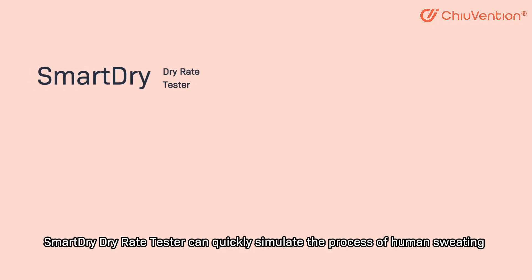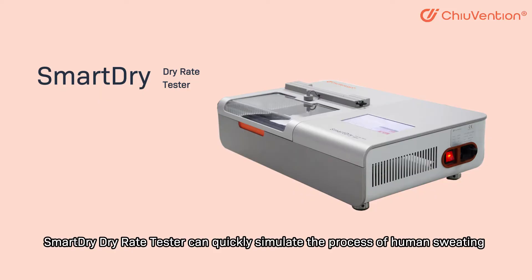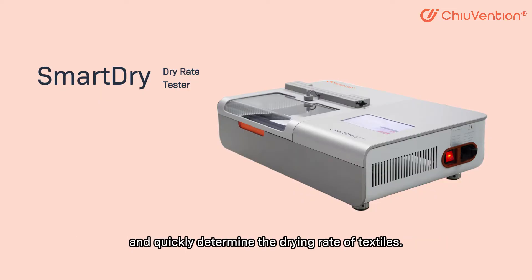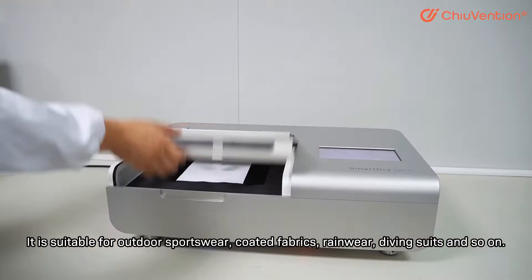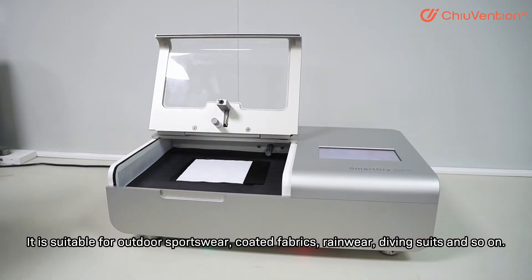The Smart Dry drying rate tester can quickly simulate the process of human sweating and determine the drying rate of textiles. It is suitable for outdoor sportswear, coated fabrics, rainwear, diving suits and so on.